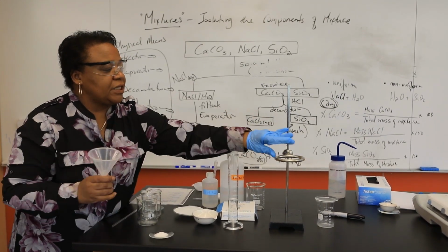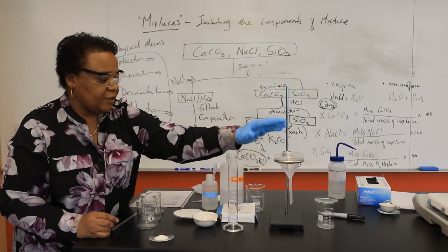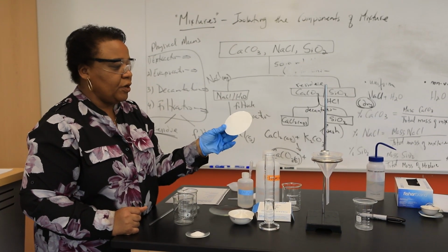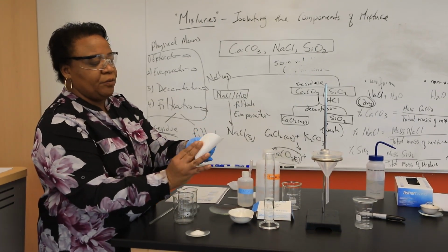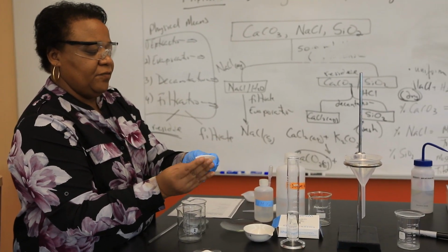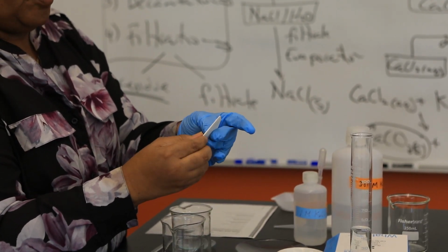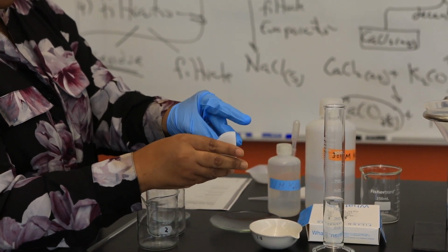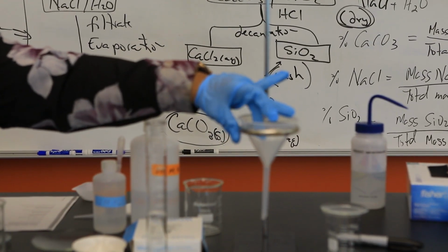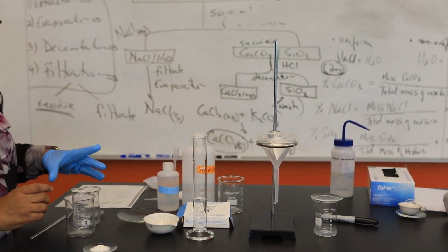Here we'll need, of course, an iron ring, a stand, right, and our wonderful, of course, funnel. Inside that funnel, you're going to see later, I'm going to be placing my fluted filter paper. And for me to get to that point, right, to flute this paper, all we do in the laboratory is that I fold this first in half, then I go ahead and fold it again in quarters. And of course, then I will just remove, right, 1/4 of that and place it directly in my funnel. Oops, my funnel is pretty large. But to keep that in place, you're going to see later, I'm going to add a few drops of water to that funnel to hold it in place.